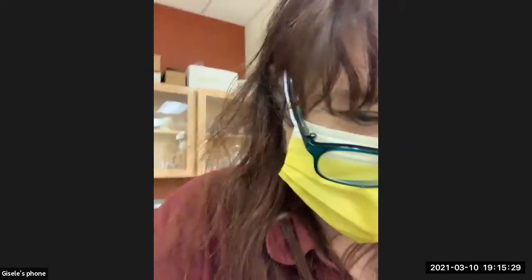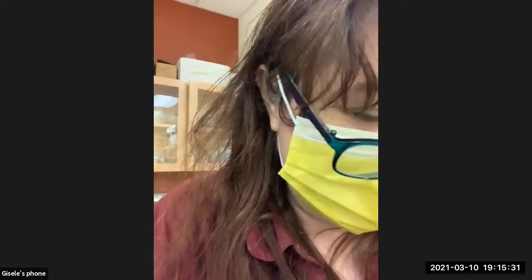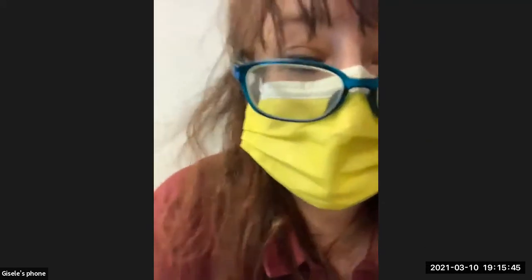I set out toys here, as I like to think of them, to make sure I showed you everything I needed to show you. Those are the instructions for making your cheek cell slide. They are the instructions for pretty much making any slide, and just have fun with the scopes at home. Be creative, explore. I'm going to show you a few more tricks in the coming days.